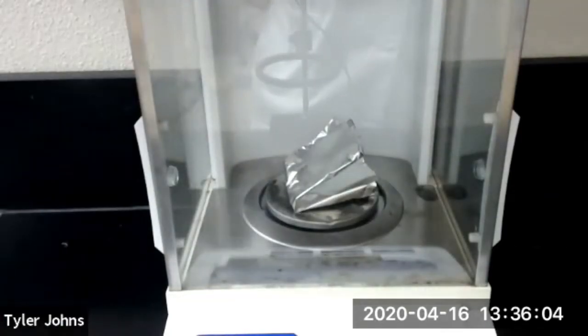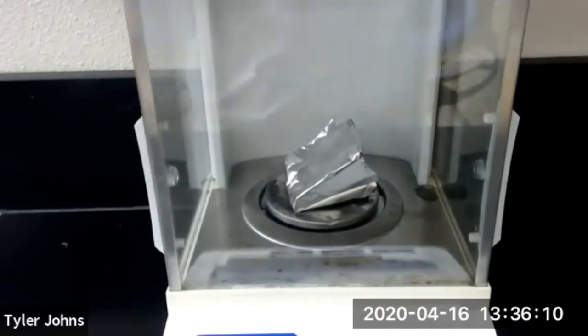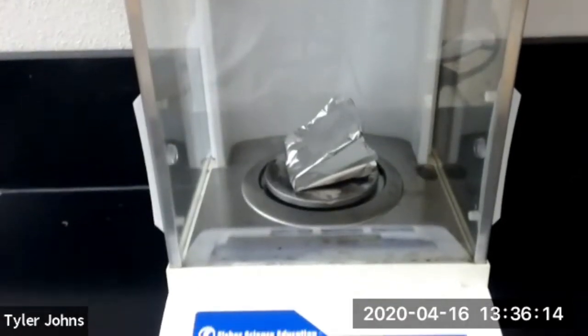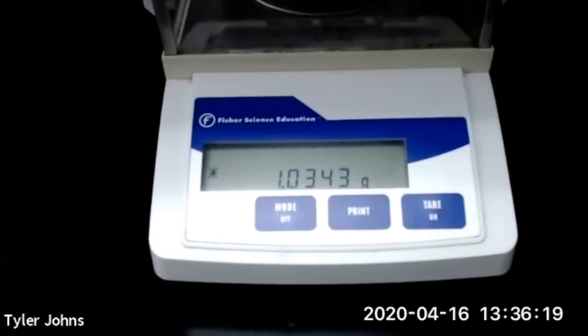The first thing we're going to do in this experiment is weigh out approximately one gram of aluminum foil. We have our aluminum foil on the scale right here, and the mass of our aluminum foil is 1.0343 grams.